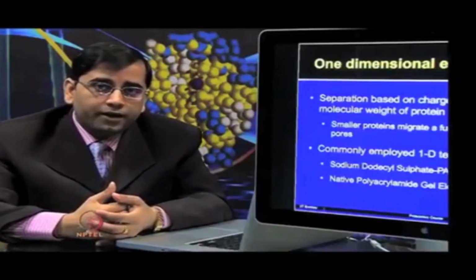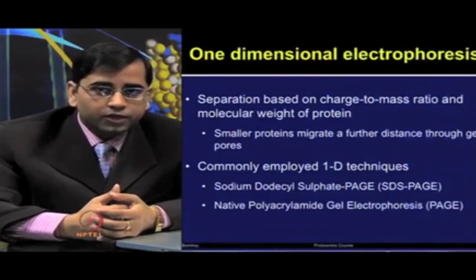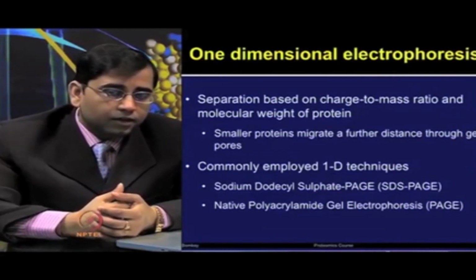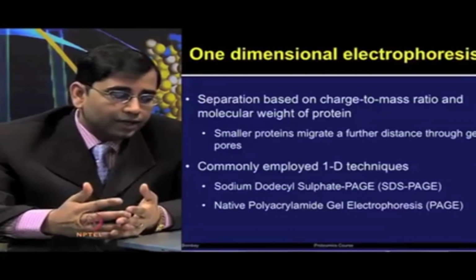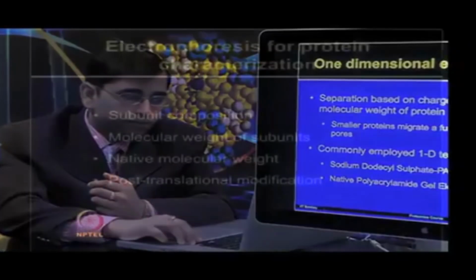Commonly employed one-dimensional techniques include sodium dodecyl sulfate PAGE, SDS-PAGE, or another technique which is used for studying the protein in the native conformation, the native form, which is known as native polyacrylamide gel electrophoresis or PAGE.